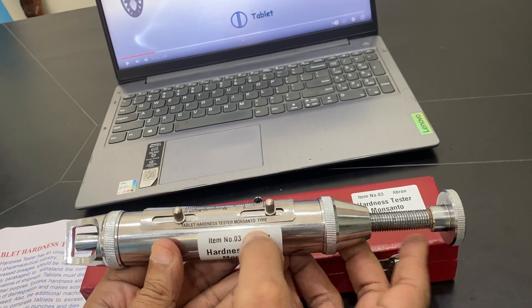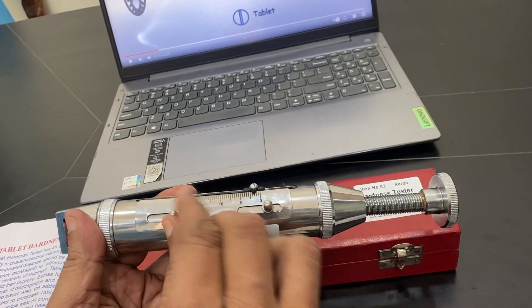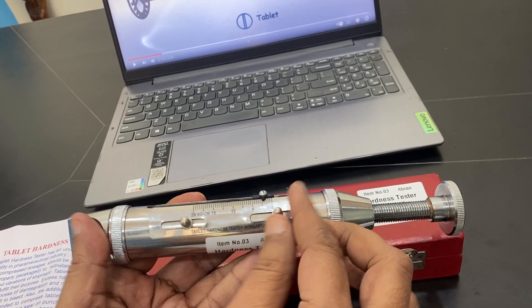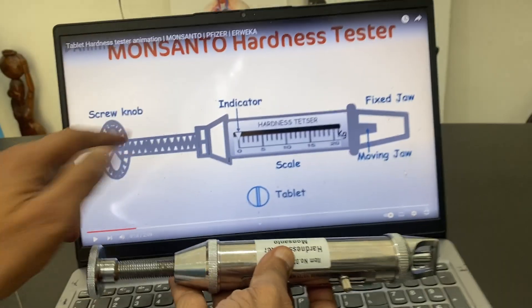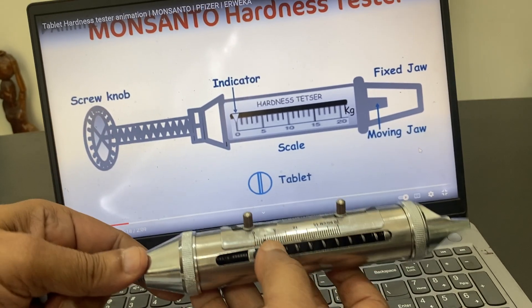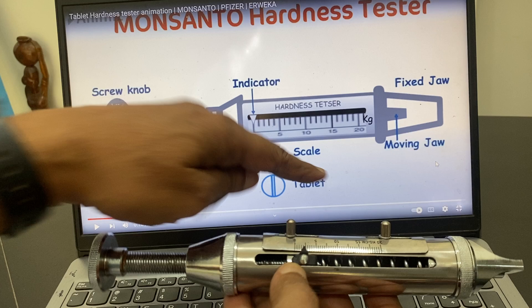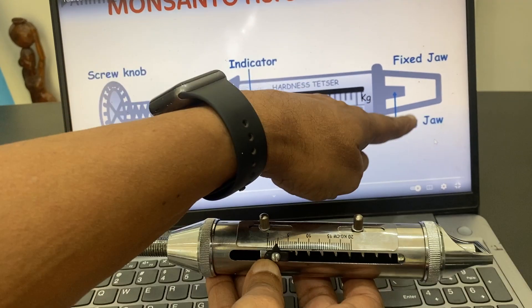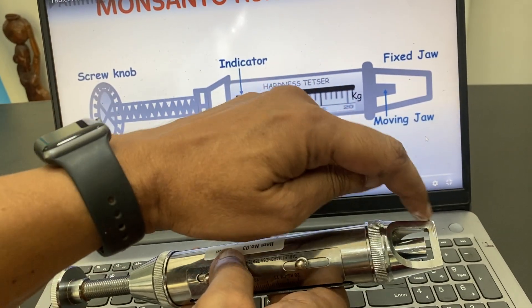This is the tablet adjustment. It can be adjusted by both screws to make it zero. Now I will show you the different parts. This is called a screw, and this is an indicator. This one is the indicator and this one is the scale. This is the moving jaw, and the fixed jaw is the outer body.